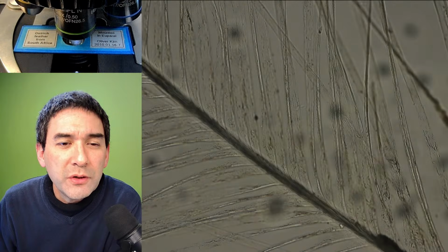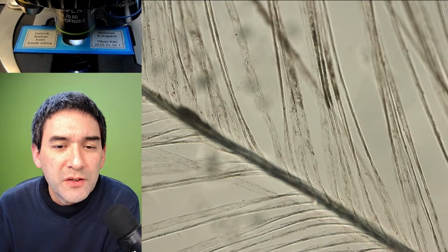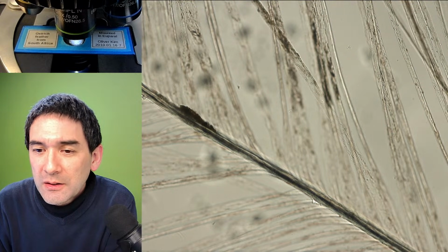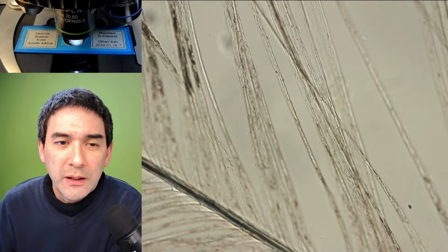Not all specimens look very nice, because sometimes there are some preparation problems, but still they do have some kind of, how do you say, sentimental value, if you want to see it like that. Let me check again. Okay. Occasionally when I pause, I will have a look here.